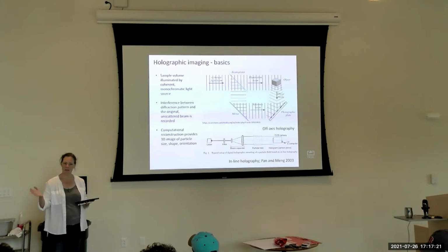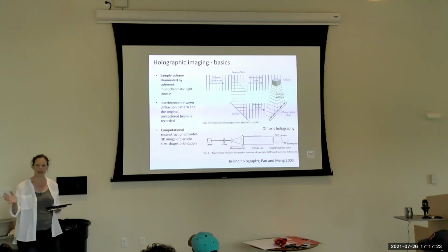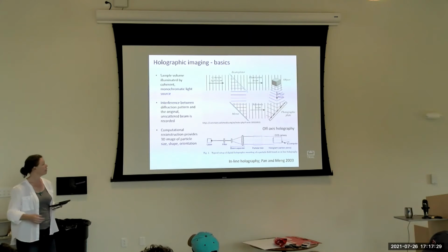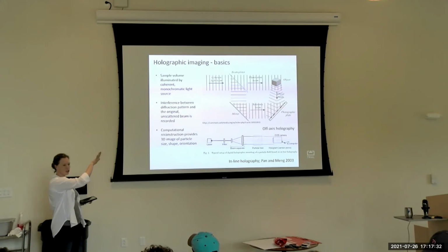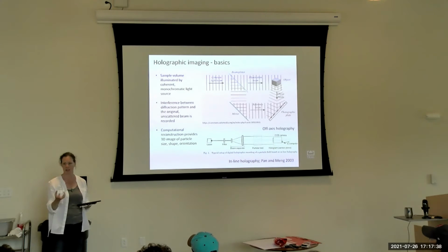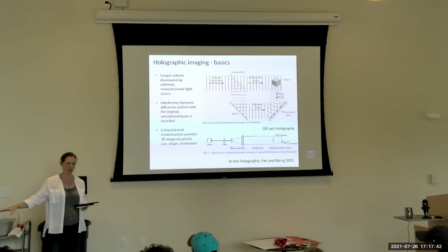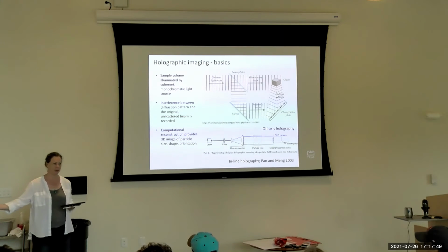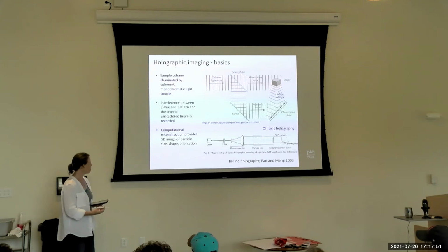In the hologram, the image that's recorded is actually the interference pattern between the light that's diffracted by the sample and the light that is not. And so that 2-dimensional holographic image records all of the scattering phase information that's in a 3-dimensional sample volume. Analog systems, decades ago, would then shine a laser back onto the hologram, and that would recreate the original image.